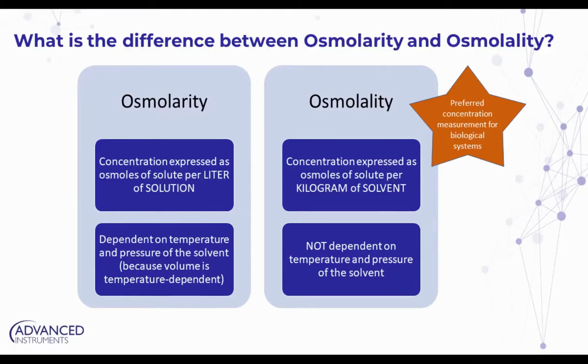I think it is extremely relevant when you prepare buffers, mainly buffers through a stock solution at a high solute concentration. And there are a couple of unit operations in bioprocessing or downstream processing which are really sensitive to temperature. One example, for instance, is hydrophobic interaction chromatography or reversed phase chromatography. So these two unit operations are extremely important, extremely dependent on temperature. Yeah?